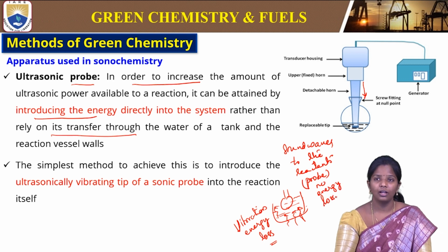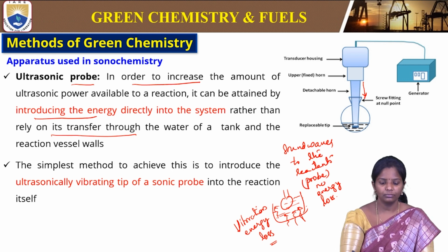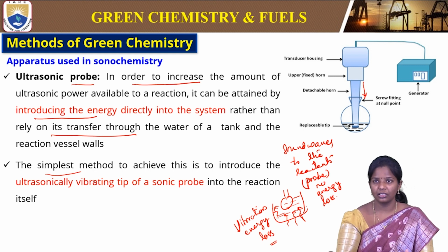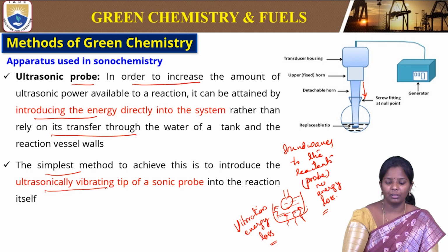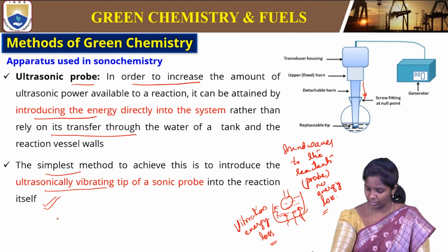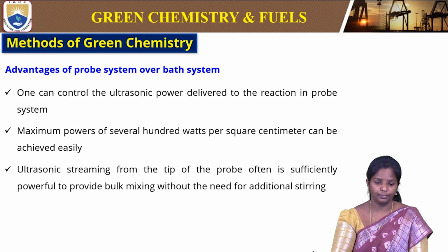So this is how we aim at increasing the reaction rate. The simplest method to achieve high energy or good reaction rate is to introduce the ultrasonically vibrating tip of a sonic probe into the reaction vessel itself. This is a simple way when compared to the ultrasonic bath.